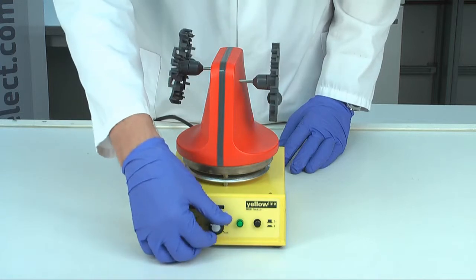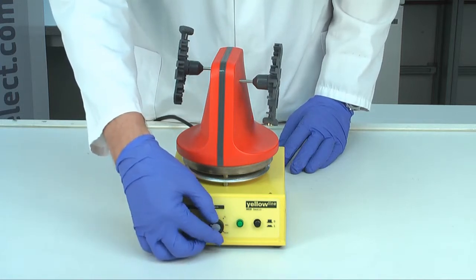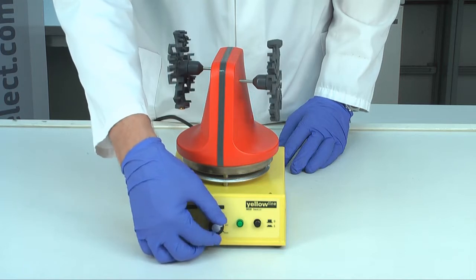This way you can mix your samples very gently or vigorously.